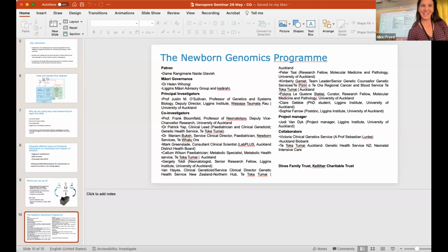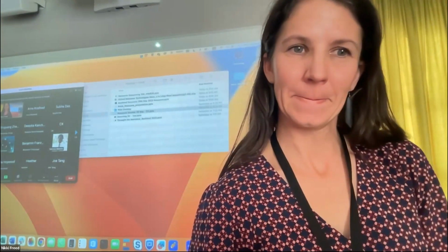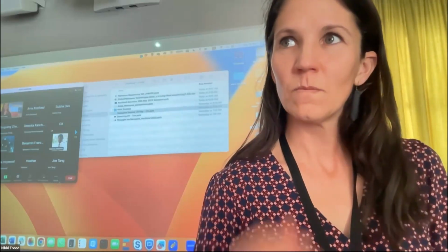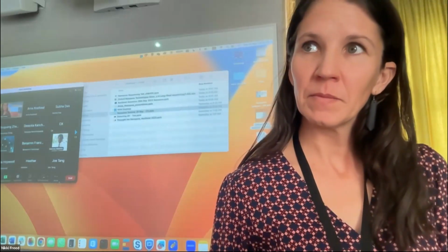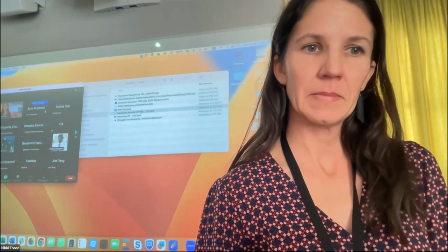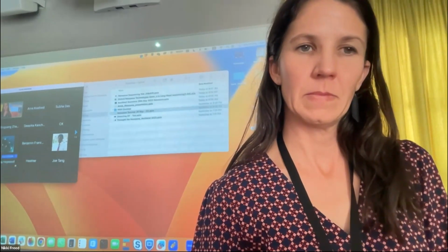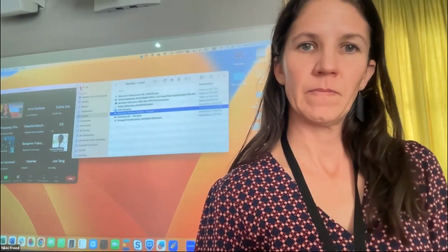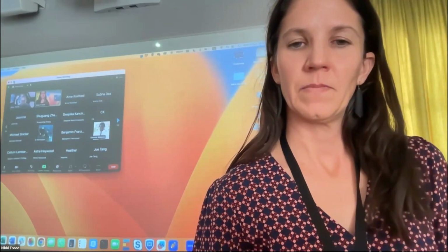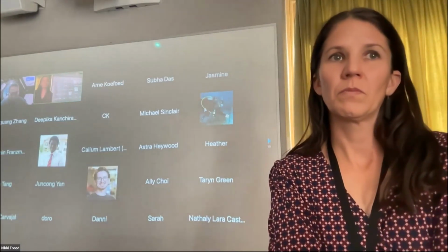Are you going to look at incorporating any automation in this whole workflow? That's a good question. We've got quite a few different setups, and we're also using Fabric GM, which I didn't mention, for integration. But we're only going to be doing 3 samples at once. For the lab work, we'll be doing them individually because it's parents and child, so we don't need high throughput. But that's something we'll look at.